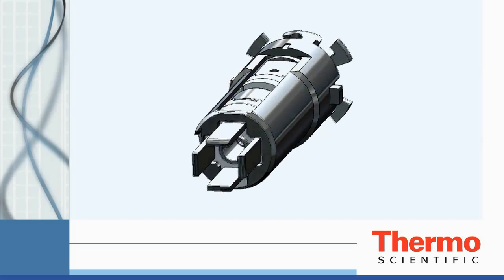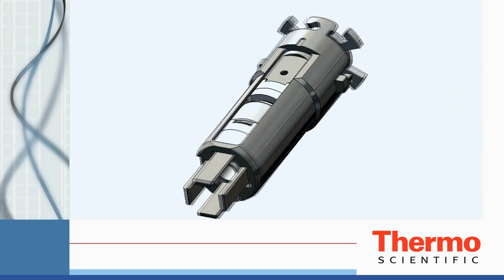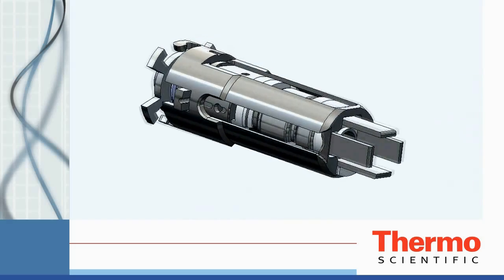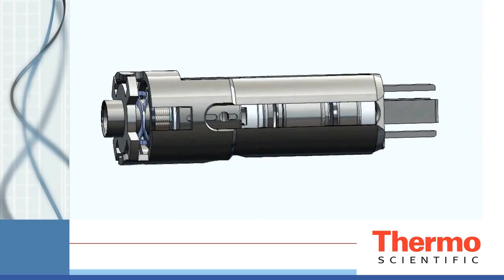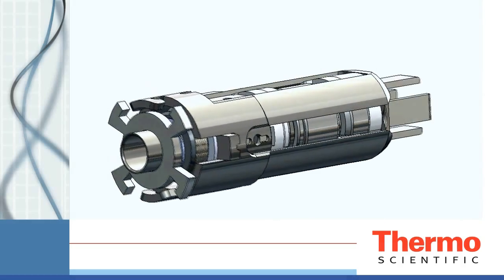Designed to offer excellent performance in all ionization modes while staying cleaner longer, the ExtractaBrite ion source can be removed from the ISQ while the mass spectrometer is still under vacuum and at temperature. The exchange takes place in about 2 minutes and you're back running in no time.